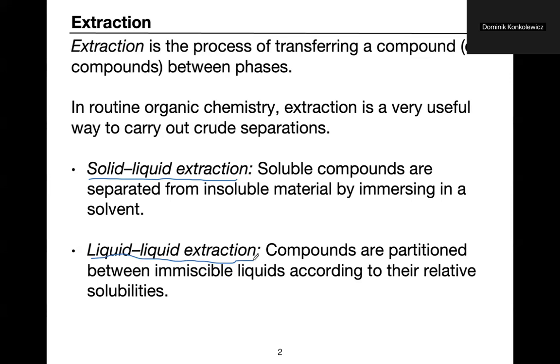So liquid-liquid extraction really requires us to have two liquid layers that do not mix. So it wouldn't work, for instance, with something like methanol and water, those two mix, and so you can't do a liquid-liquid extraction in that case. Okay, so the two liquids have to be immiscible, and the compounds are then separated between these two immiscible liquids, so our organic layer and our aqueous layer, depending on which phase they prefer to be in.